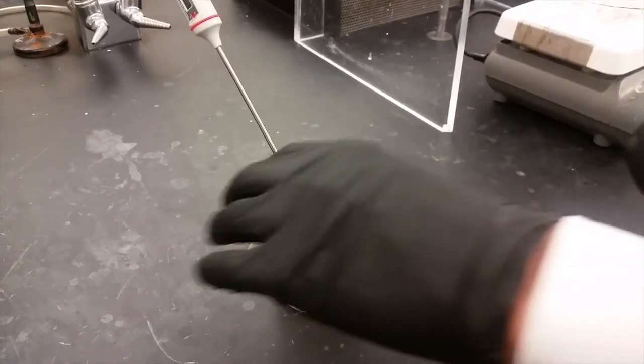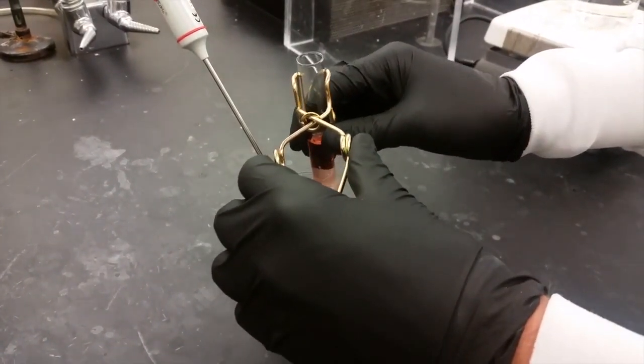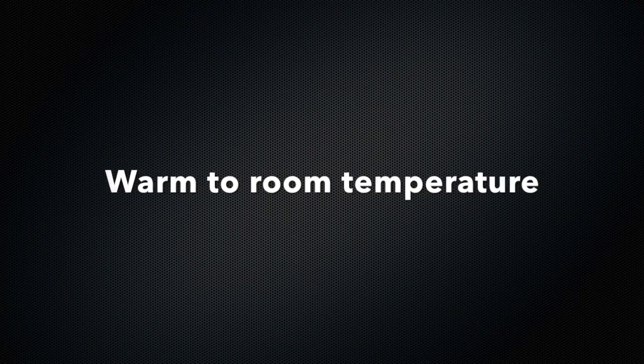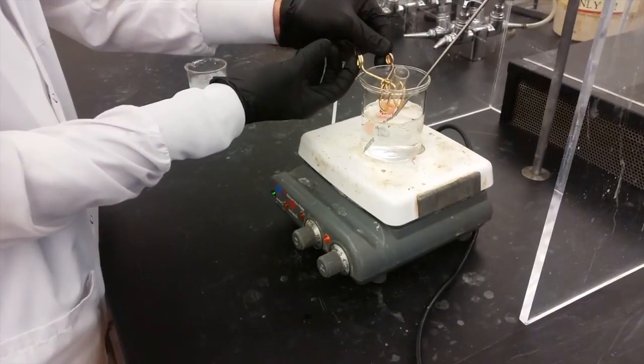One thing that you'll do in the experiment is change the temperature of the solution, and you'll have a test tube that you'll be moving from an ice water bath to hot water. Just so that we avoid any shattering of test tubes, which can happen if they change temperature too suddenly, when you take your test tube out of the ice water you'll want to hold it in your hands to warm it up to room temperature before you put it into the hot water bath.